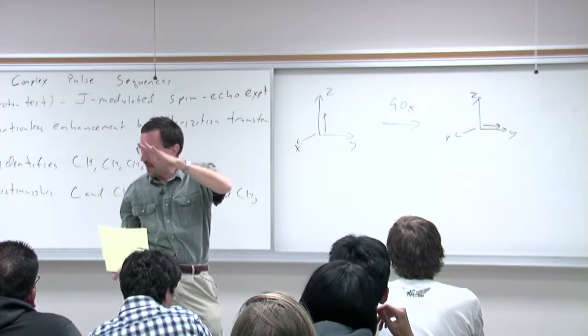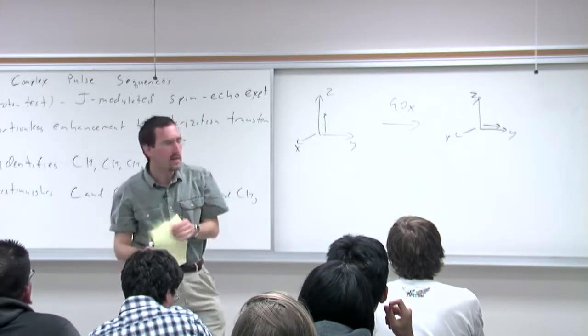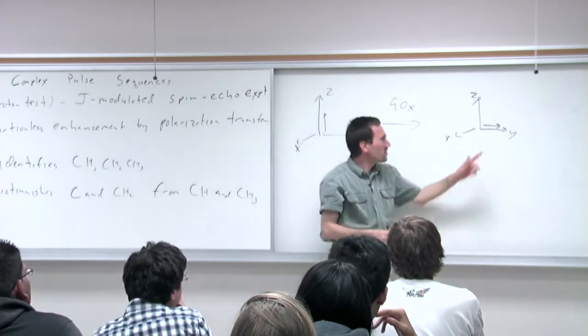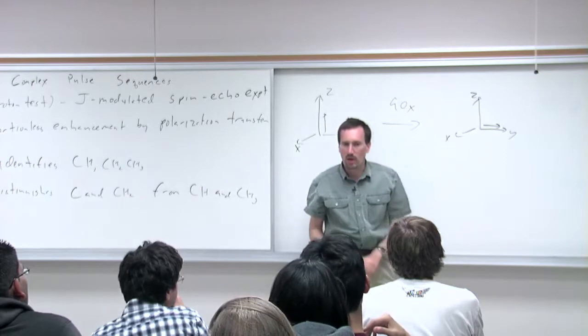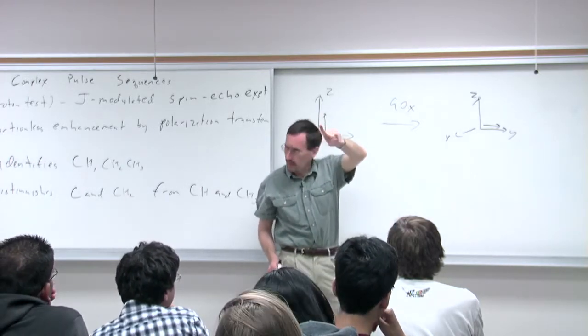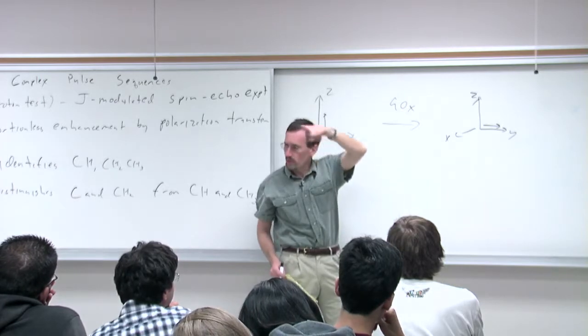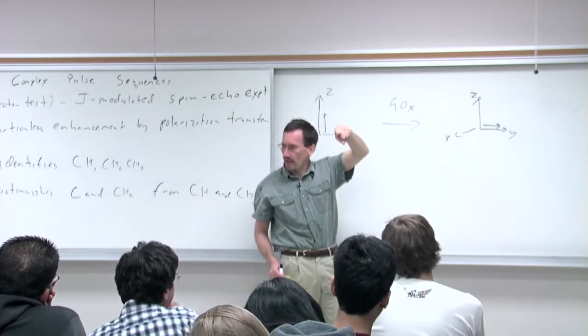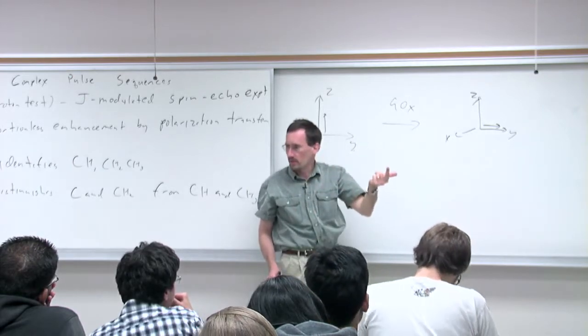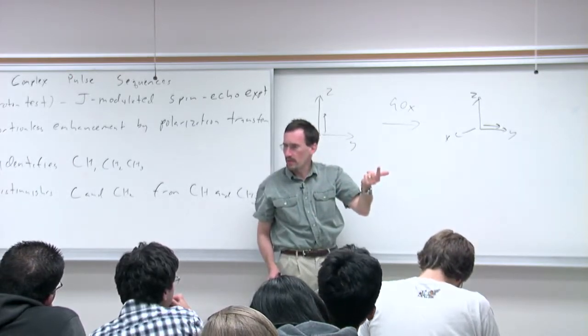What you do have is magnetization on the xy plane. And because you've done this as a pulse, all of your vectors start out initially along the y-axis, and then remember you have your precession that leads to motion in the xy plane of the vectors, and that gets picked up by the coil and gives you a cosine wave that when you Fourier transform gives you a peak.